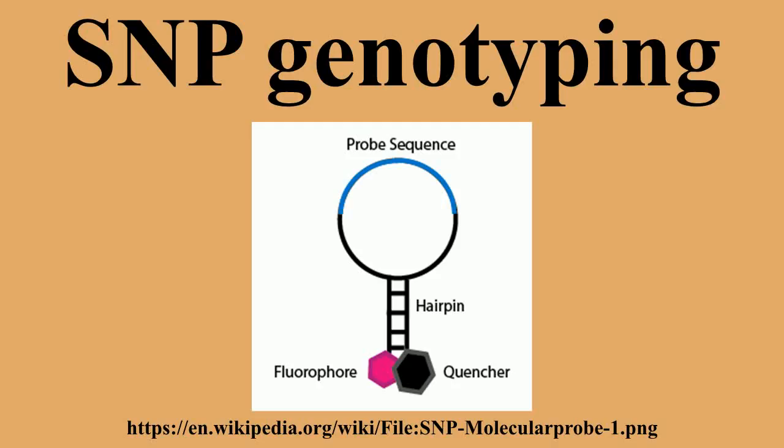In examining the results, if a genomic sample is homozygous, then the PCR products that result will be from the primer that matches the SNP location and the outer opposite strand primer, as well as from the two outer primers. If the genomic sample is heterozygous, then products will result from the primer of each allele and the respective outer primer counterparts, as well as the outer primers.